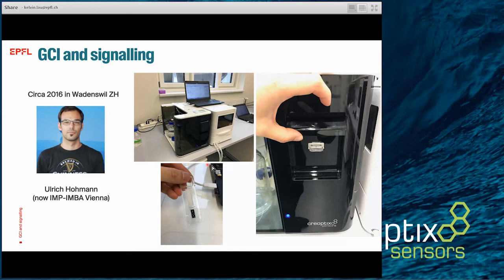The system was small. We saw the chips, as Fabio showed before, and here's the port that the chip goes in. At least on the exterior, it looked quite sleek, and it was very easy to figure out what exactly to do with the machine.